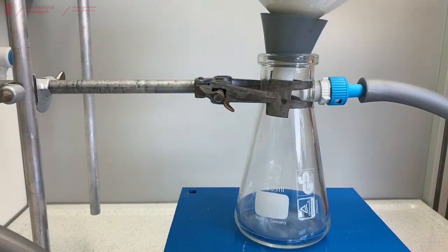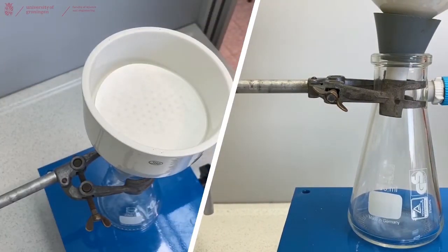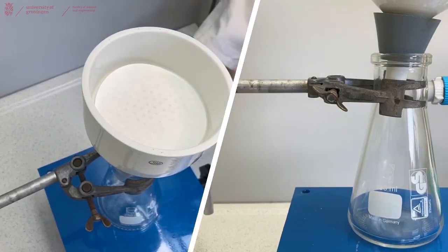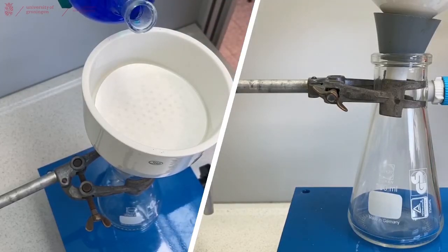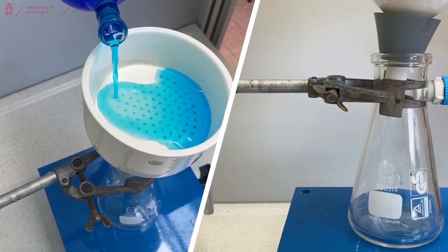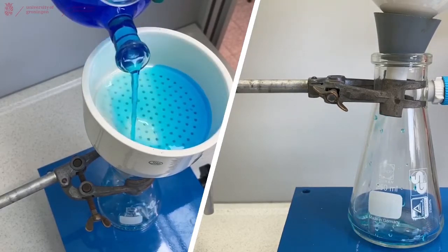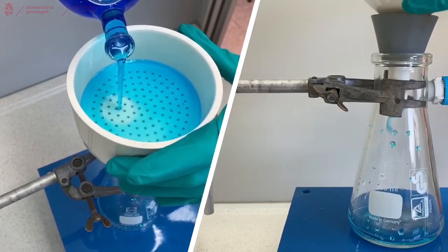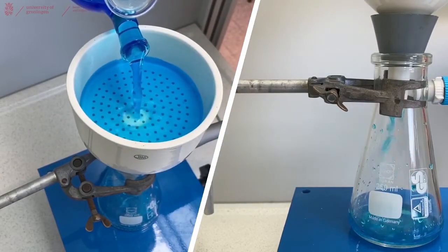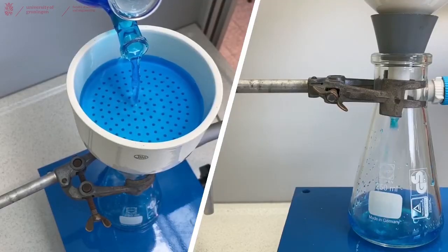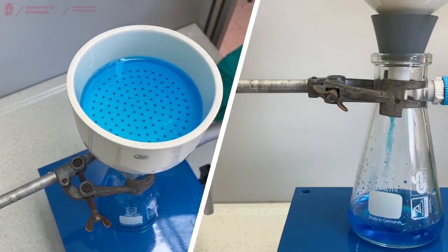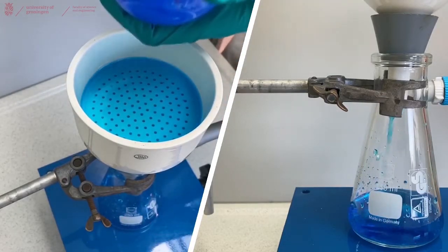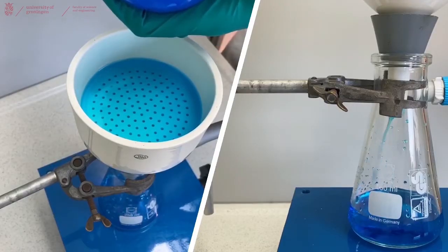You should hear a small flow of air, and then you can pour your solids with its liquid on top of the filtration. Make sure to do this carefully so that none of the solids can actually go underneath your filter paper. I already noticed now that these solids are very stuck in my flask, so I'll use my spatula to release them.